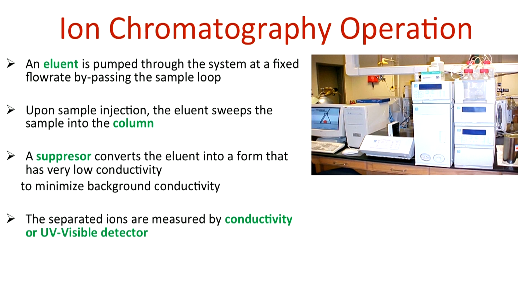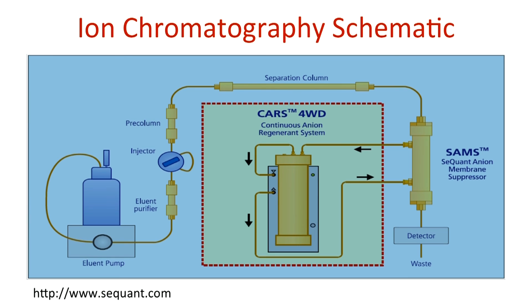So that's all. And for the AAS, you should review the PowerPoint in the previous lab. The last part here is the schematic diagram of ion chromatography, which I already mentioned to you.